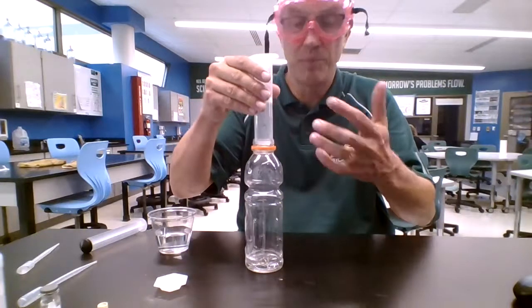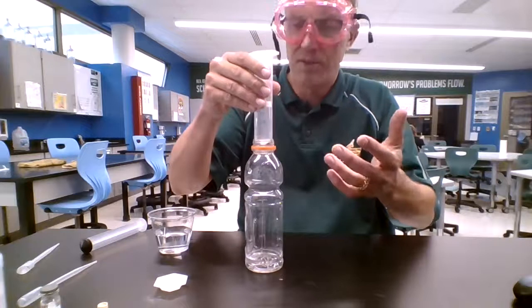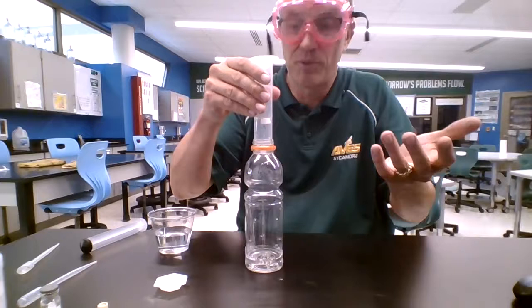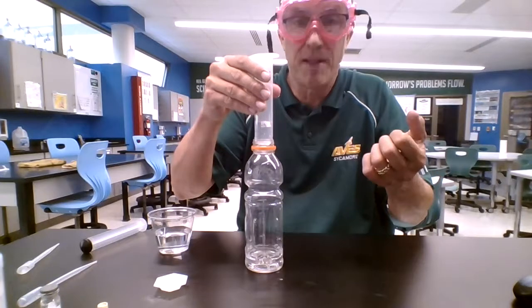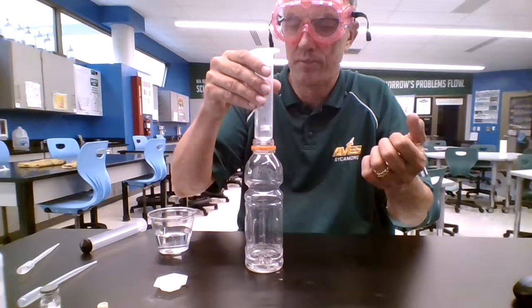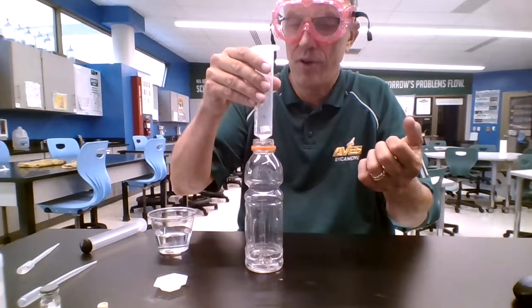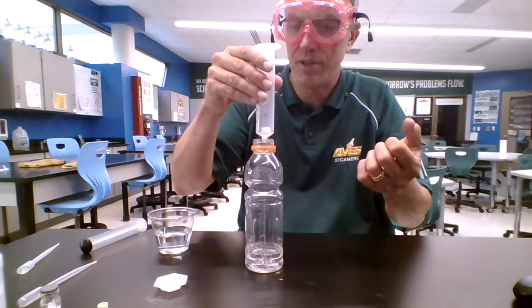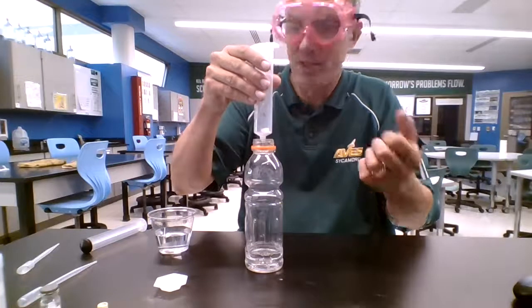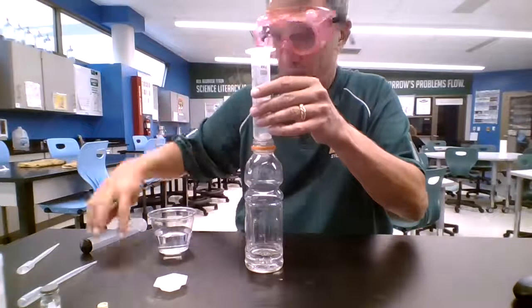And this is really pretty cool because now, we'll do this over and over with just different chemicals and get different gases. That's a really cool part about this. But for this one, we're just going to react baking soda and vinegar. And we don't care about the water, so it's kind of cool. So here is... And it's upright, and it did not get wet. That's the good news.